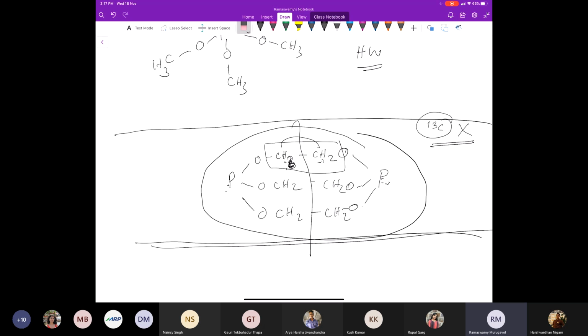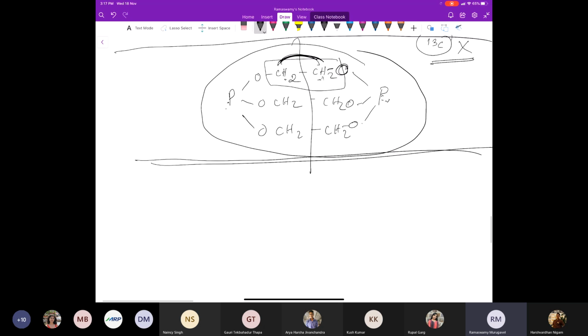And a CH2. So you also have to consider this coupling. Okay, I think you can solve this problem. I don't want you to go to the one without oxygen on one side. Okay, what is it telling? I forgot. Oh God.